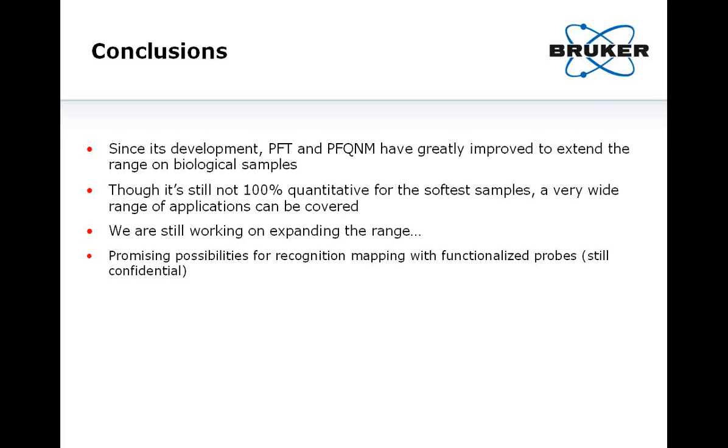The next slide is about the conclusion. Since its development, PeakForce Tapping or PeakForce QNM have greatly improved to extend the range on biological samples. Though it's still not 100% quantitative for the softer samples especially, a very wide range of applications can be covered now. But again, it's not perfect. Working on super soft samples requires an accurate calibration, which is very difficult to obtain on agarose and gelatin.